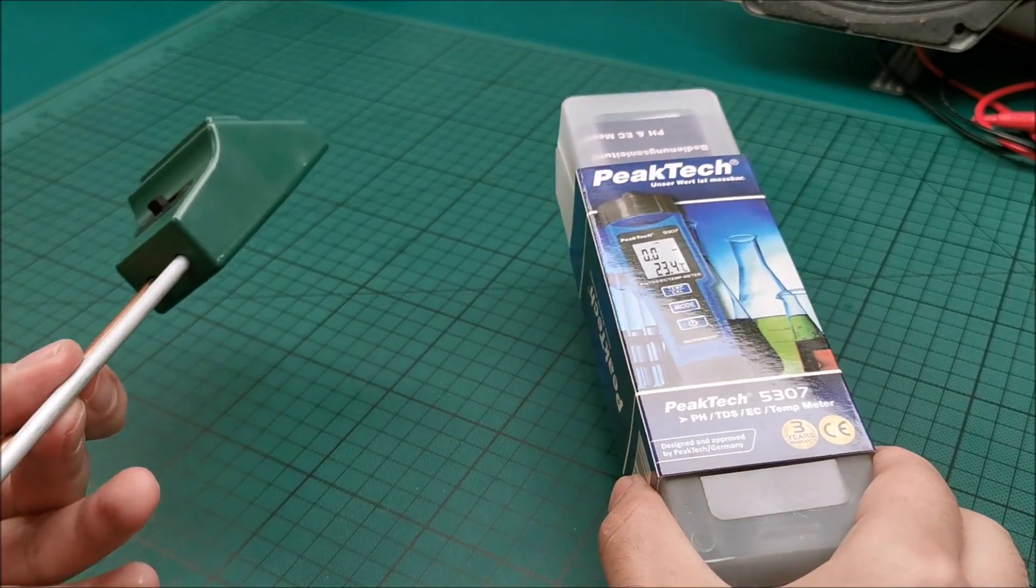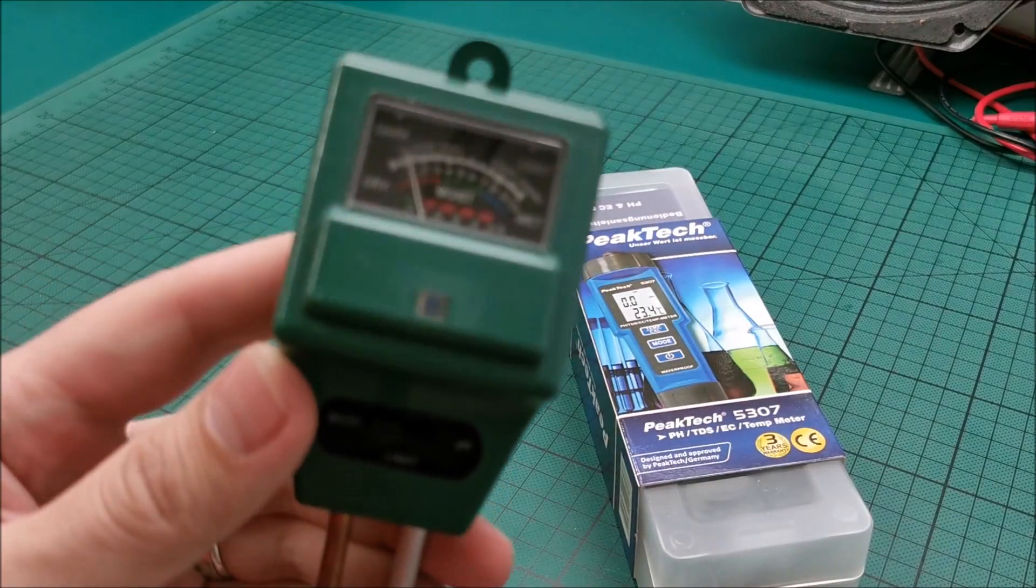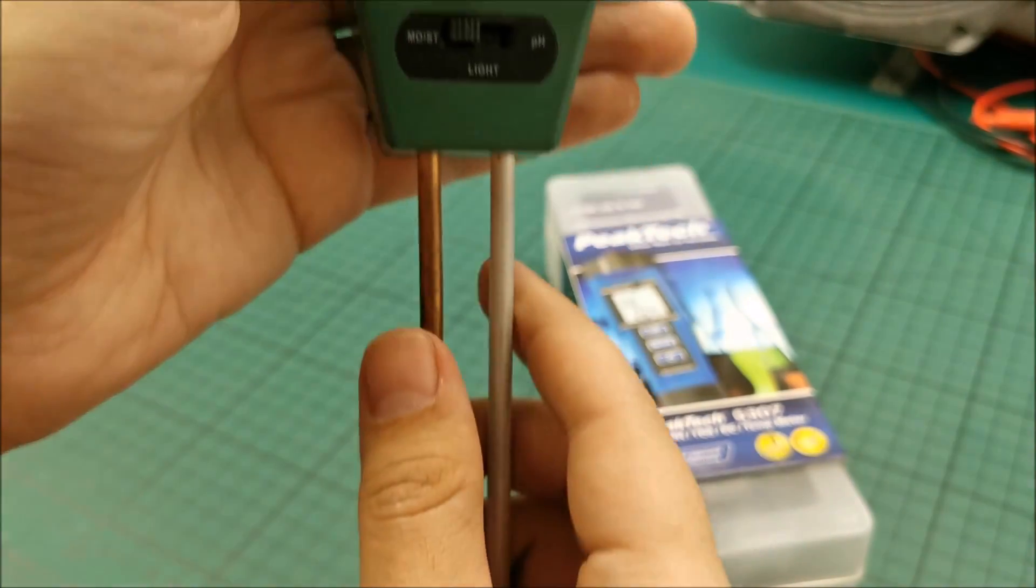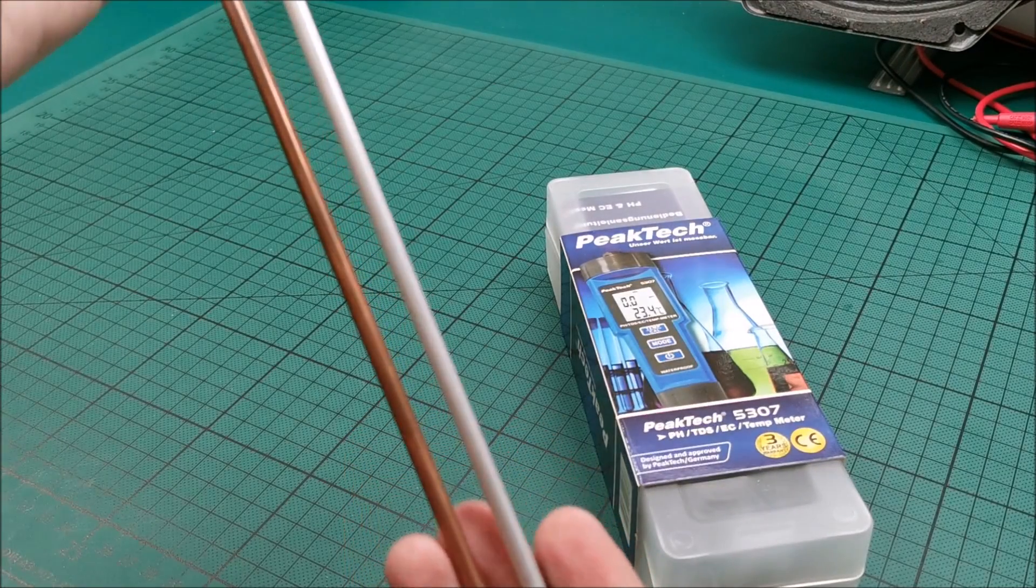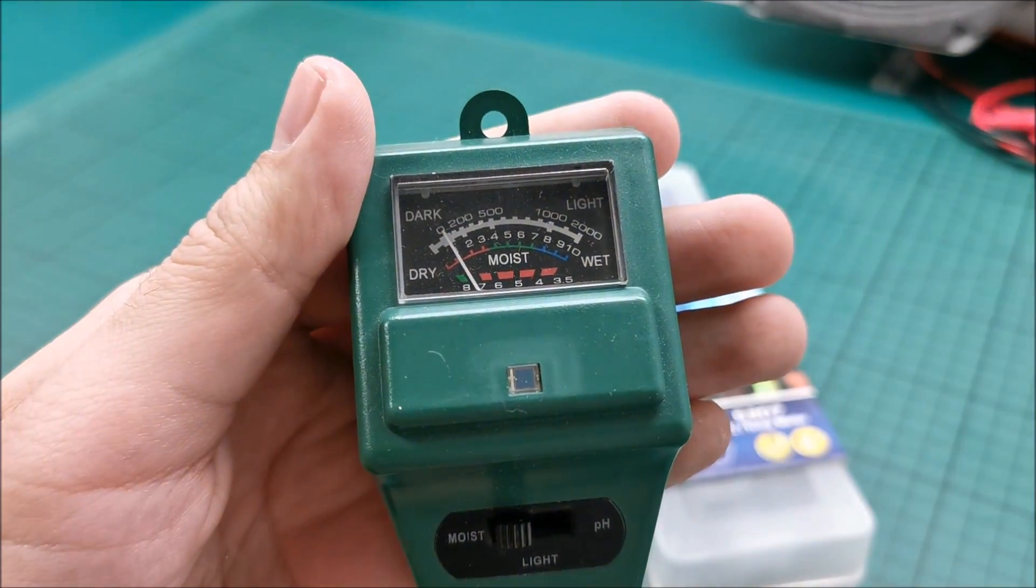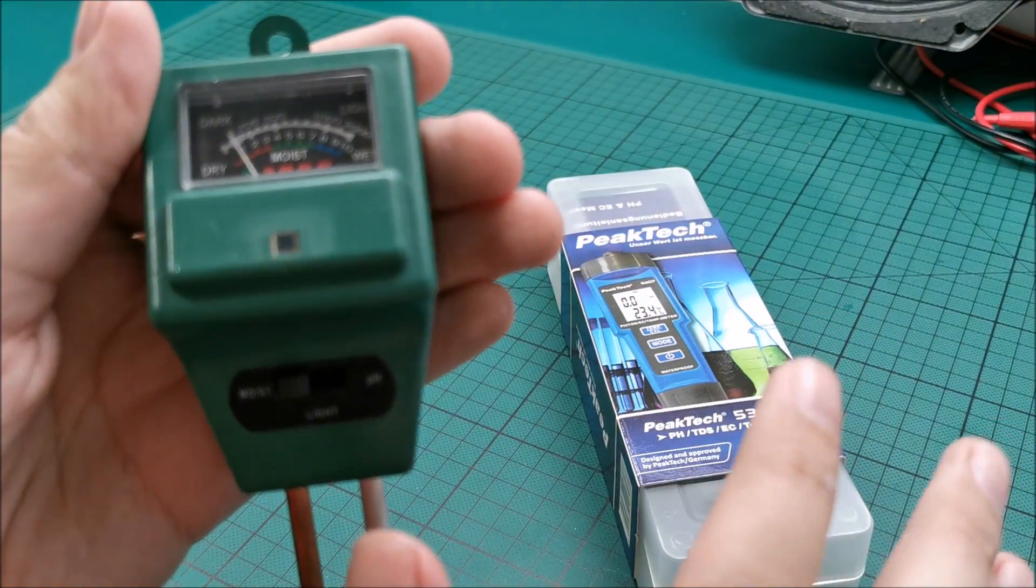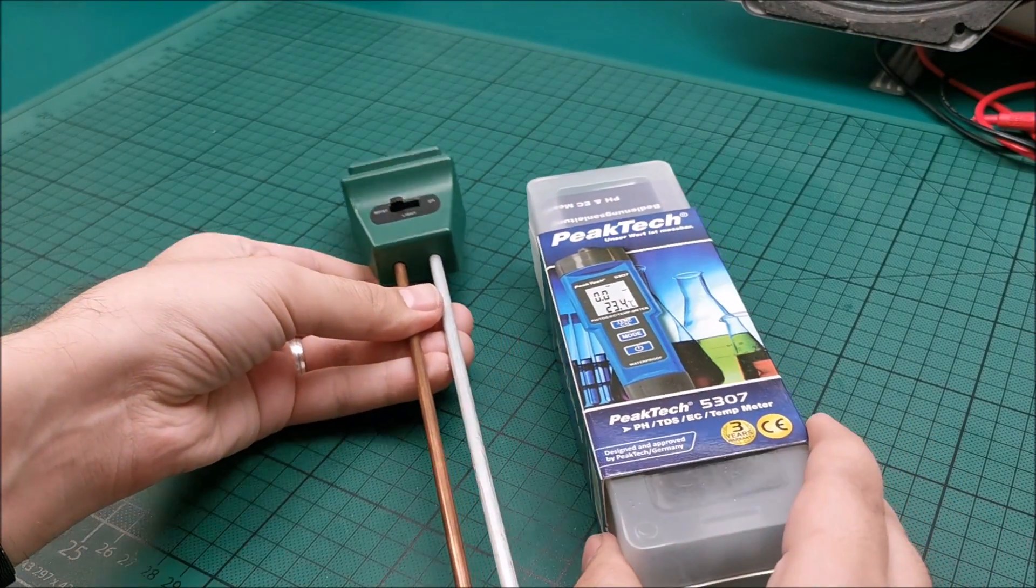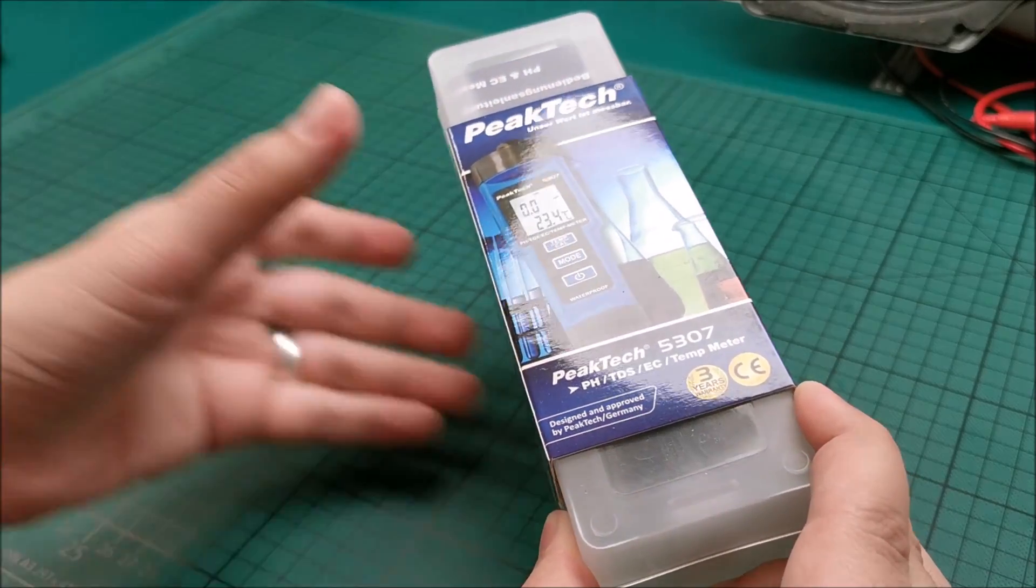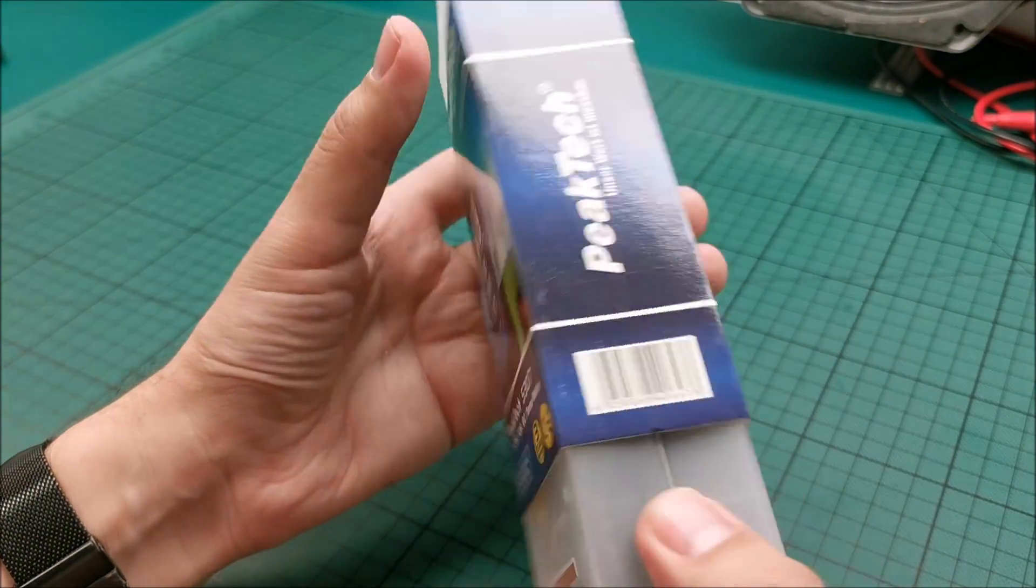And up until now for my flowers for example, I had this little guy. It works, but it's not exact at all. It just gives you a hint. We will be testing it with the PeakTech. So safe to say the PeakTech is much more accurate and much more complete.